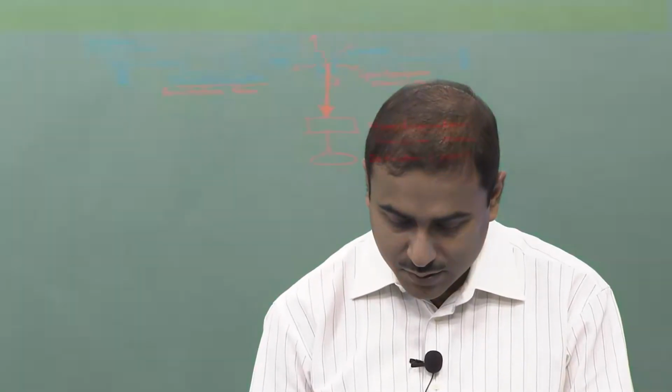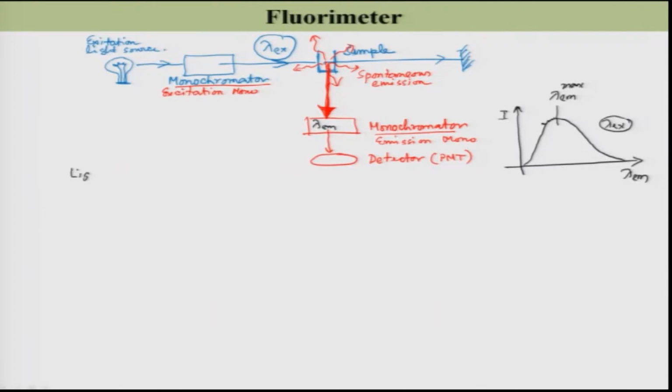Let me say that clearly: the light source, monochromator and detector are not ideal.